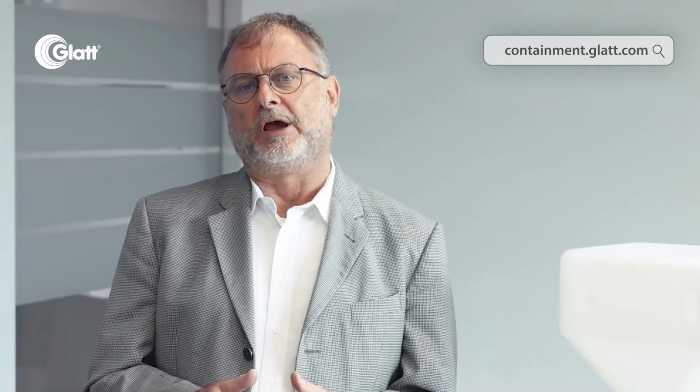Some handling activities, like washing or maintenance, are not as frequent as the dispensing or the bin-to-bin transfer. The machine is washed maybe every week, maybe even less often. Maintenance is just done once a year. Here, it might be more economic to think about different equipment for those handling steps which you do more often and more frequently. And depending on the risk analysis, it might be acceptable to wear personal protection equipment instead of getting highly specialized equipment for high containment.